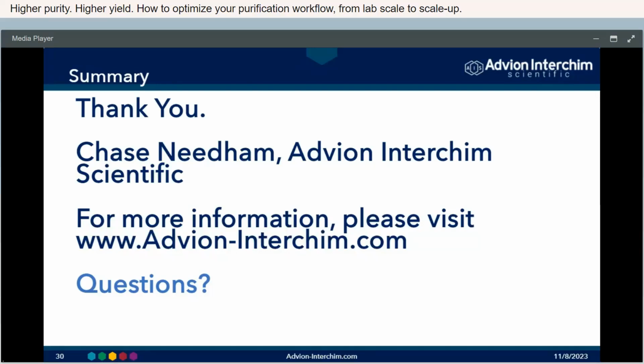Great, thank you. I have another question for you here. This one asks, how do I choose my column size for a purification? Oh, good question. Column size is always going to be determined by a couple of factors. The number one factor is going to be the amount of crude material you have. Obviously, more crude material means you need more silica to purify it. So that's the number one factor.